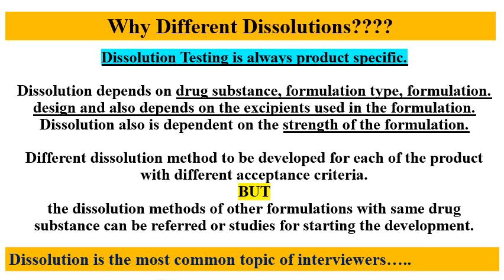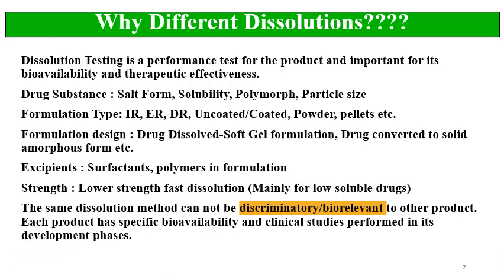The methods which are already available in the literature, we can use as a starting point, or refer to them for starting the development. But every method should be specific as per the formulation and the API. Once again, we will discuss this topic in detail.